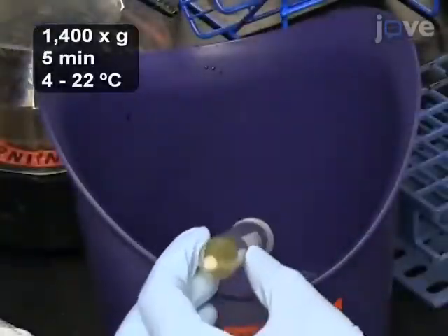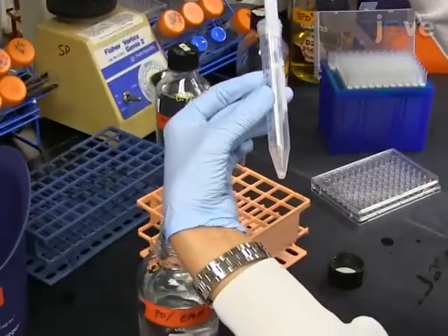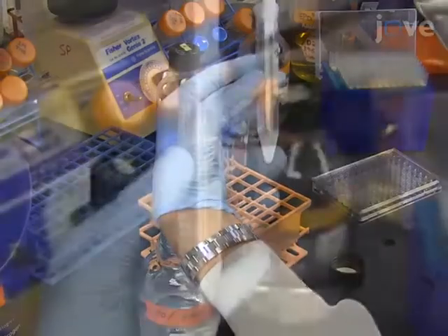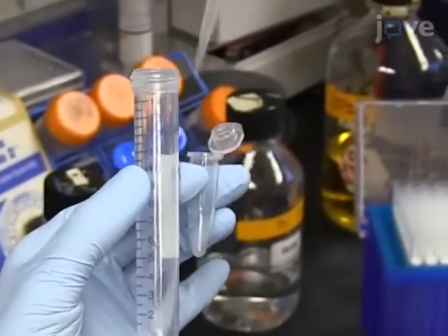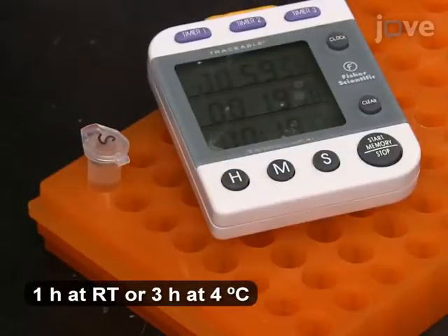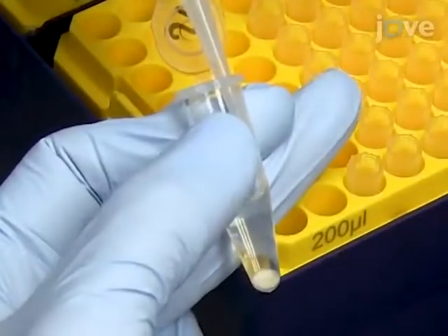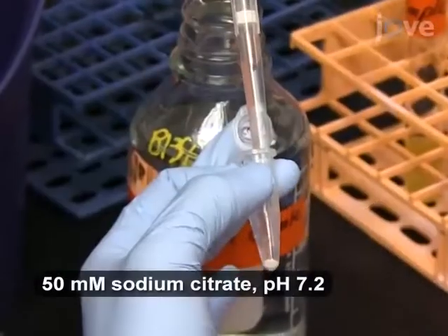spin down the cells and re-suspend them in 1.5 milliliters of 70% ethanol. Then, transfer the suspension to a 1.6 milliliter microfuge tube and let the cells incubate at room temperature for an hour or for at least 3 hours on ice. After the incubation, spin down the cells and re-suspend them in 1 milliliter of sodium citrate.